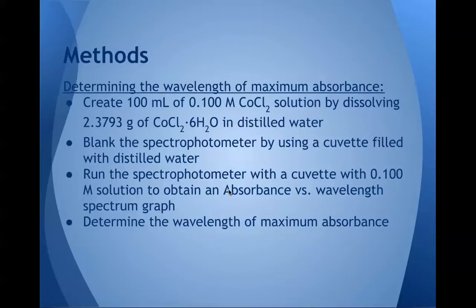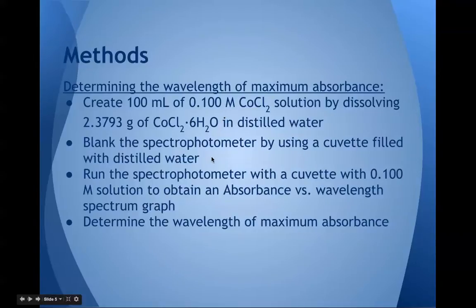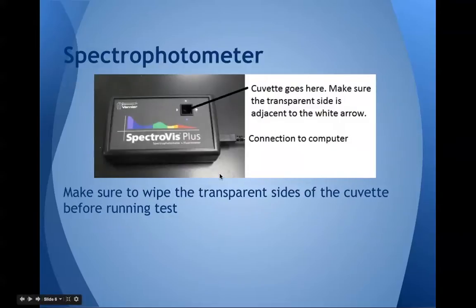Some methods: To determine the wavelength of maximum absorbance, we first created a 0.1 molar cobalt chloride solution. Then we blanked the spectrophotometer using a cuvette filled with distilled water. We ran the spectrophotometer with a cuvette containing the 0.1 molar solution to obtain an absorbance-versus-wavelength spectrum graph, and used this graph to determine the wavelength of maximum absorbance. Here's the spectrophotometer we used — you can see the hole where the cuvette goes, and we made sure the transparent side is adjacent to the white arrow. We also made sure to wipe the transparent sides of the cuvette before running each test.